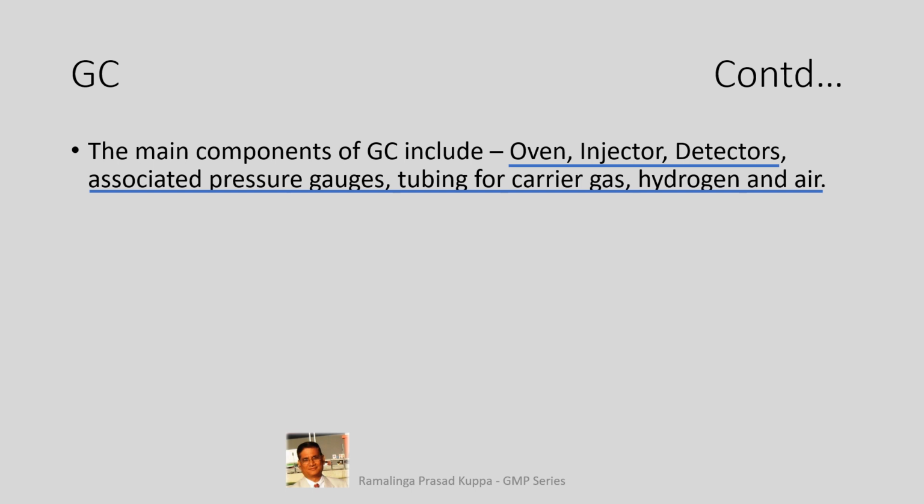The operating temperature should be between ambient to 450 degrees Celsius. Ramp rate should be between 60 and 80 degrees Celsius. The cooling pattern should also be faster. The oven should be cooled down to ambient temperature within 5 minutes.